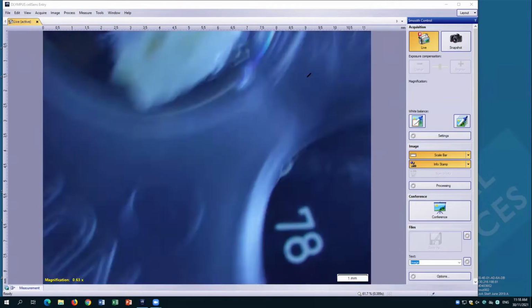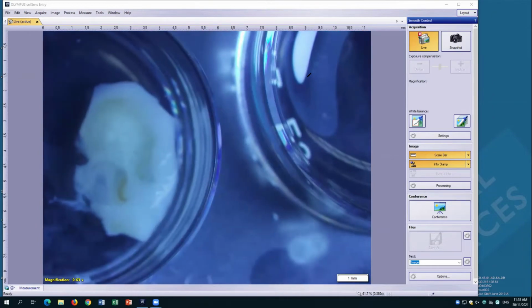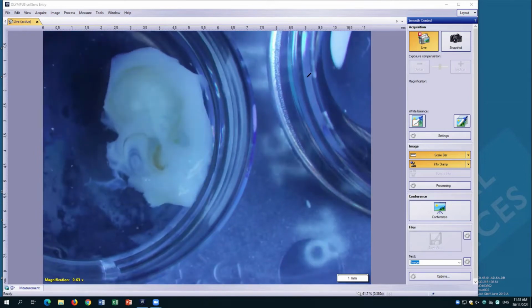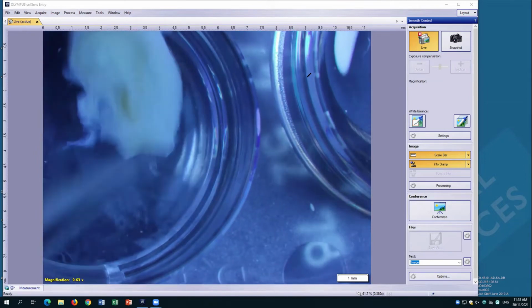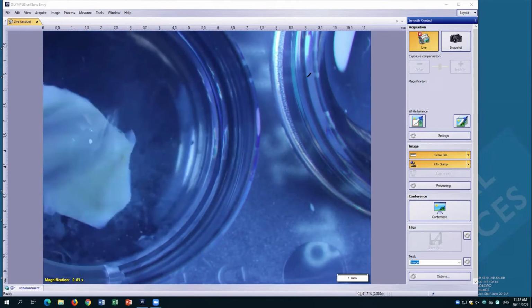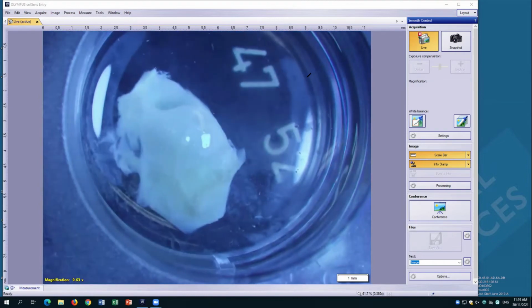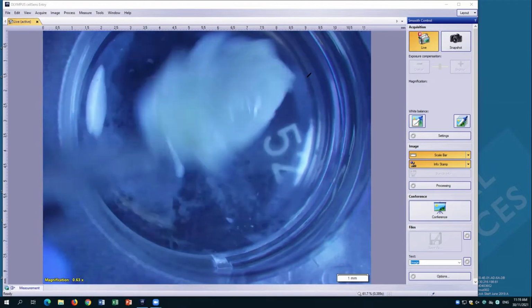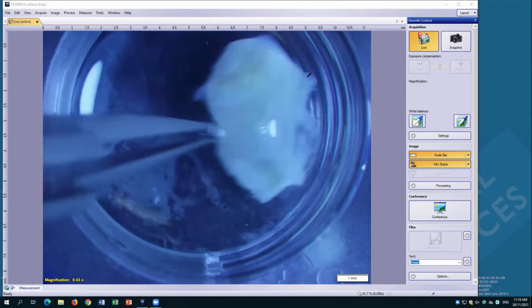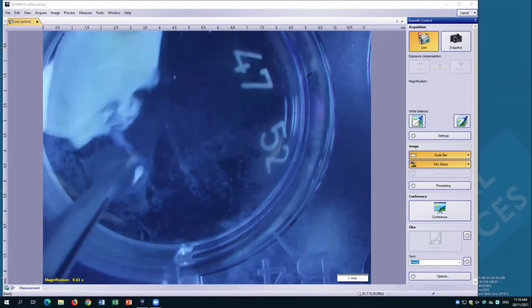Now the sheep cochlea can be dissected further, so I'm just going to show a few. Okay, so this is a sheep cochlea, which you guys were looking at before in this orientation, and then it's been cut open. So now it's gone soft enough, we can do this.